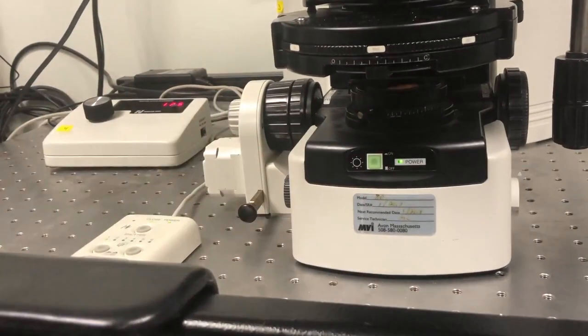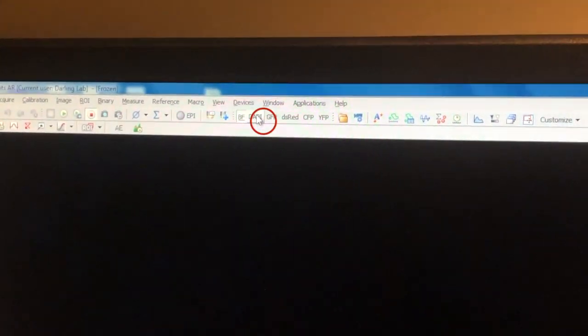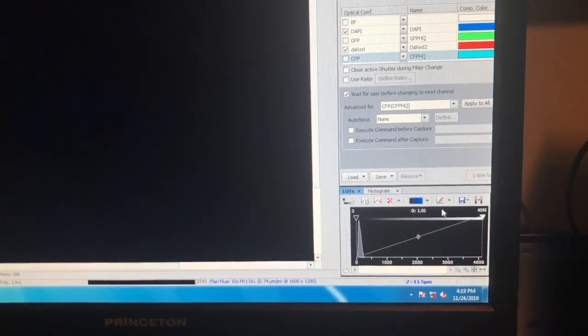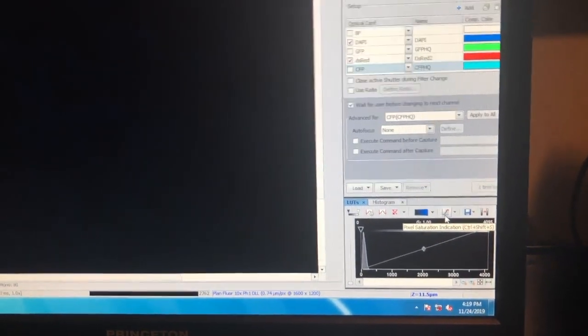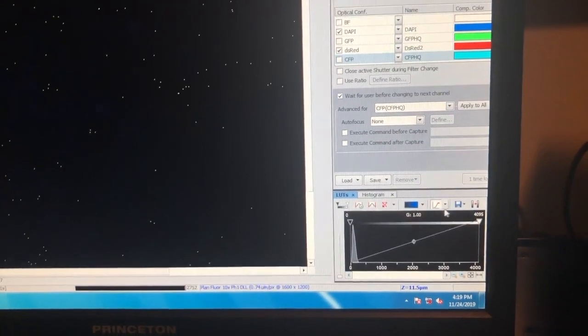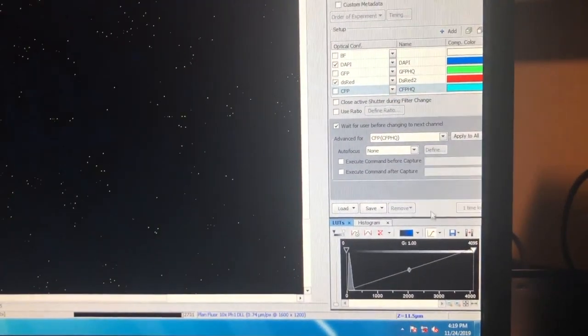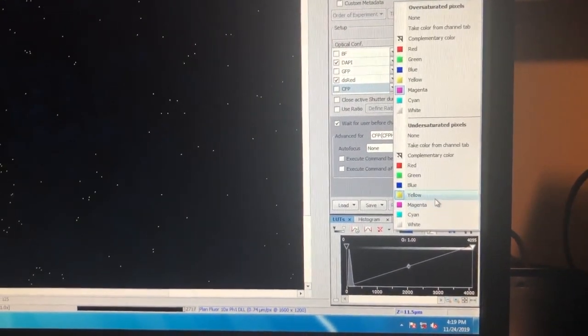Now turn the lamp off, then select the filter set of your choice using the pad. This will be the options 2 through 6 or using the filter set menu bar. In this example, we are using the DAPI filter, and then press play to see a live image of the cells. In the LUTs and histogram window, click on the harsh S-shaped graph image and use the drop-down menu to select magenta for oversaturated pixels and yellow for undersaturated pixels.